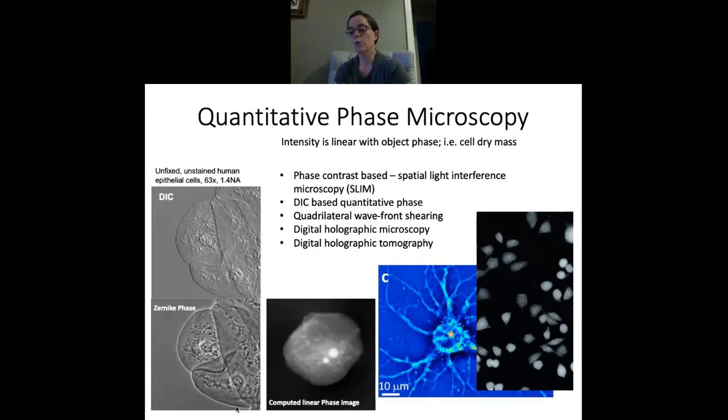On their own or paired with live cell fluorescence, you can use transmitted light greatly to extend both the limits of temporal resolution and the longitudinal limits of time-lapse microscopy. The main thing I hope you'll be able to take away from this presentation is that transmitted light imaging methods are ideal for live and quantitative microscope applications.